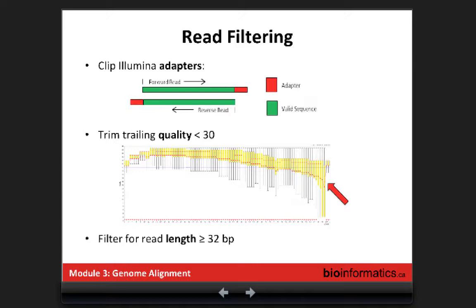So when we observe this kind of pattern, it's really rare, but sometimes it occurs. For example, 1.5 years ago we had a problem with the temperature in the room of the sequencer, and the temperature went up. For the emergency, we stopped everything, put the temperature back to a good level, and restarted, and we had one cycle where the quality dropped. In these cases, we use specific tools to not take into account these bases, and we change every call to an N.